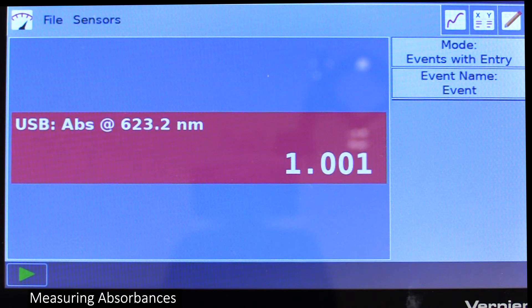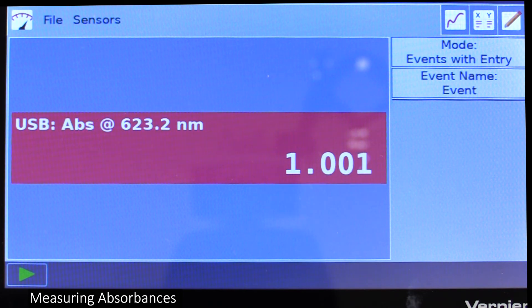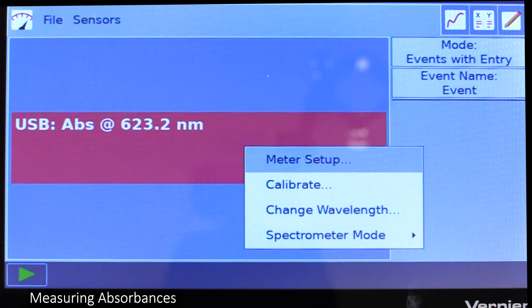The red box on the meter screen should now display both the absorbance of the solution and the wavelength you're taking this measurement at. If you need to, you can manually change the wavelength by poking the box and selecting change wavelength.